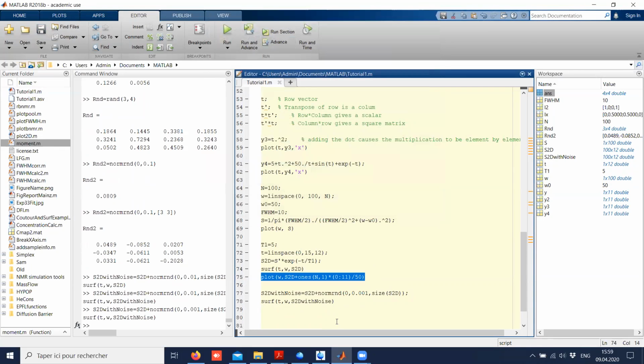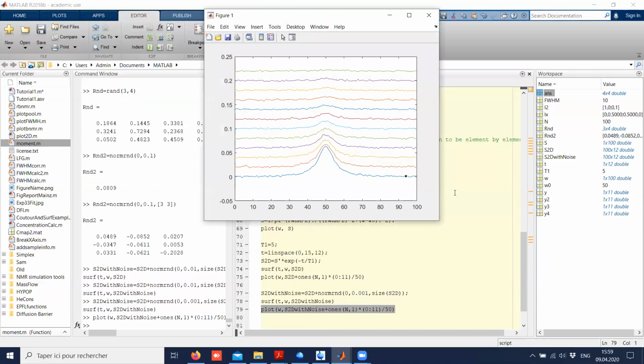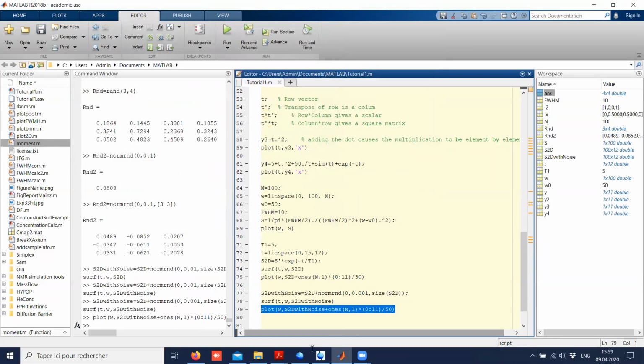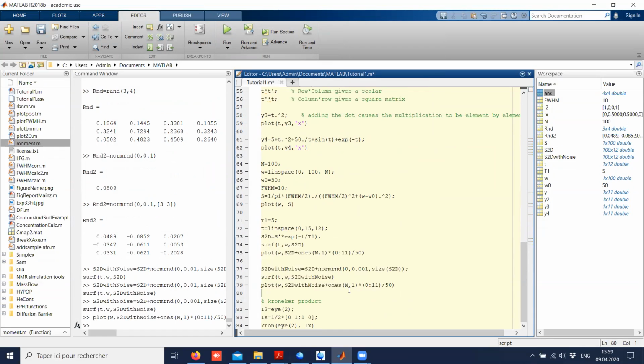And of course, for several curves, we can also do it like this. Now I'm plotting them line by line. I was obviously kidding when saying that you can make up data, but it's just interesting to know how to create this false data. To me, it is quite instructive on the way noise behaves. Do you have any question on these random functions?